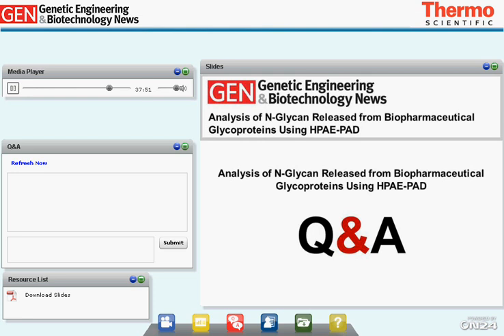Each set of electrodes, as it is shipped, includes a quality assurance record, a sheet that lists all those data that were determined during the QC testing. Thank you very much. And Sebastian, we have some questions for you.